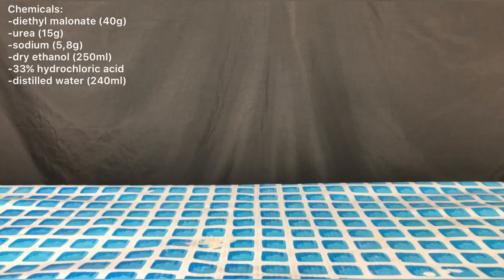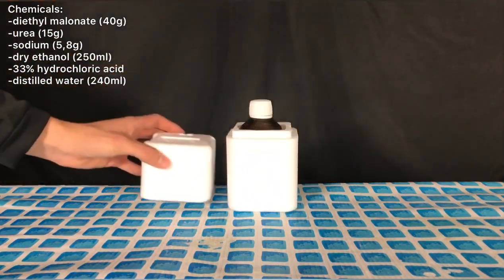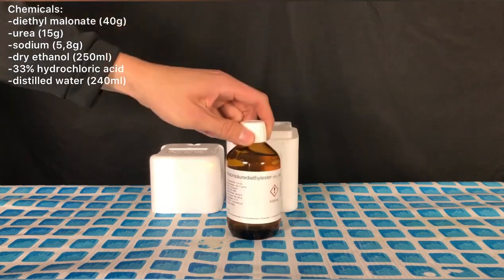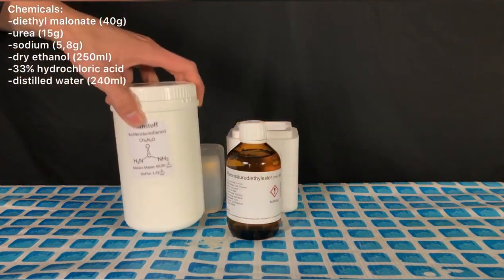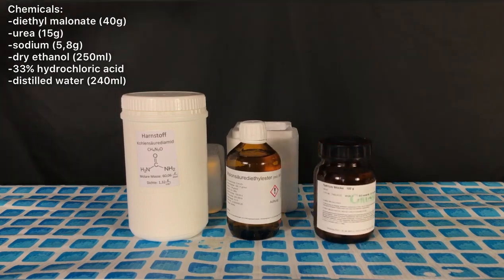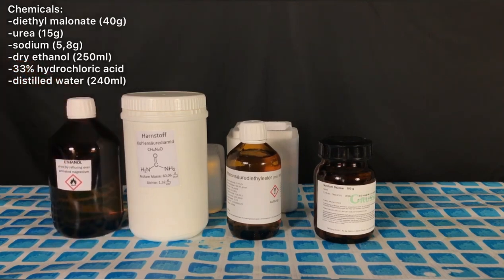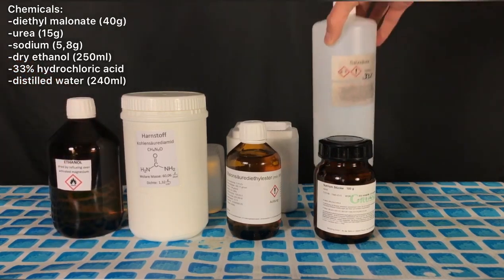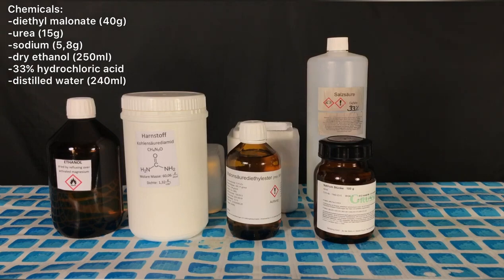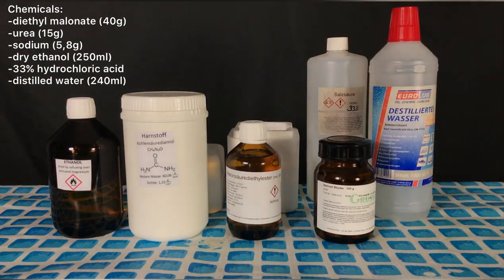For this project, you will need 40 grams of diethyl malonate. Furthermore, 15 grams of urea, 5.75 grams of sodium, we used 5.8 grams, 250 milliliters of dry ethanol, 33% hydrochloric acid, and lastly 240 milliliters of distilled water are needed.